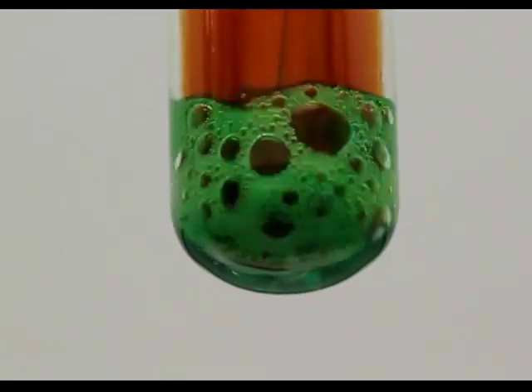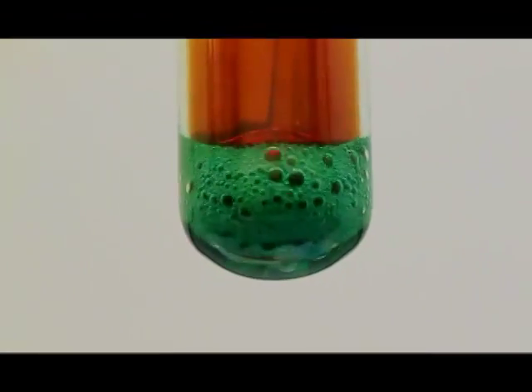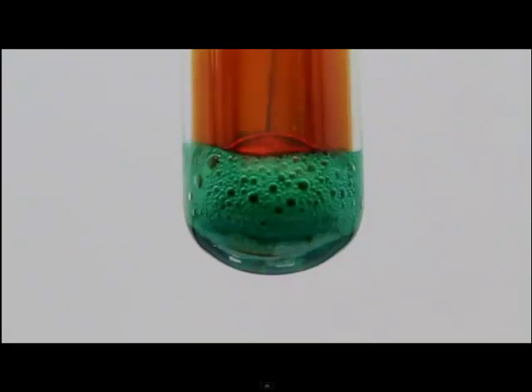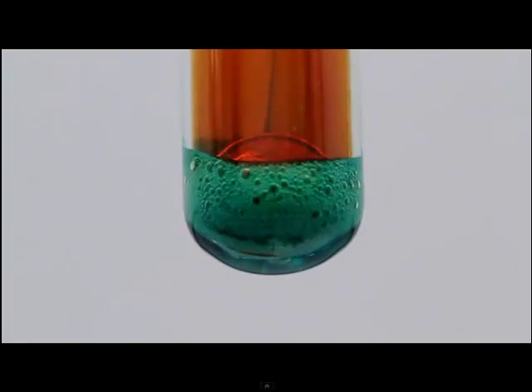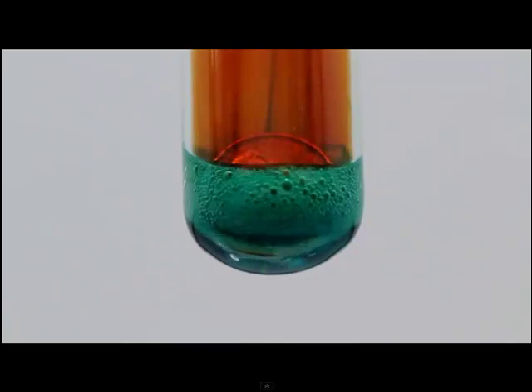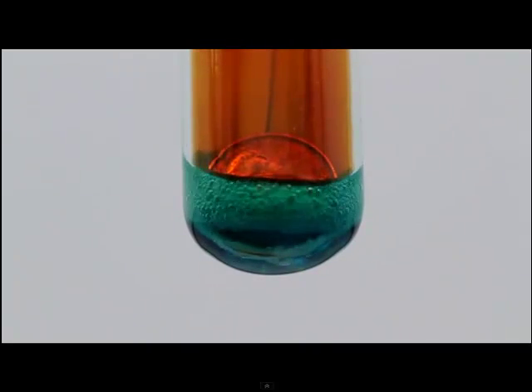As it is added, you see a brown gas being produced, and the solution is kind of a more bluish greenish color. From our observations in lab 17, we might be able to identify what is that bluish greenish solution. What could it be? You also see bubbles forming. What could those bubbles be?